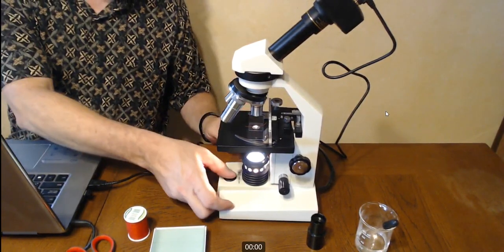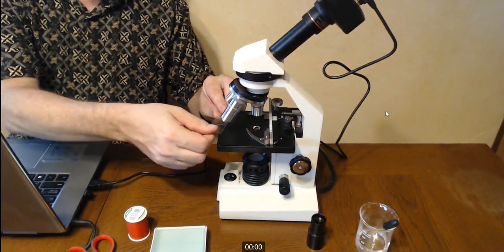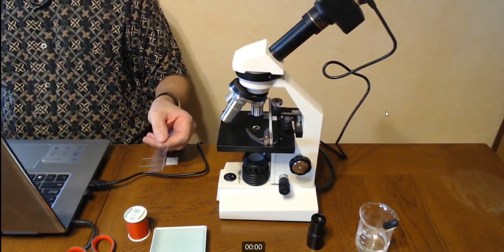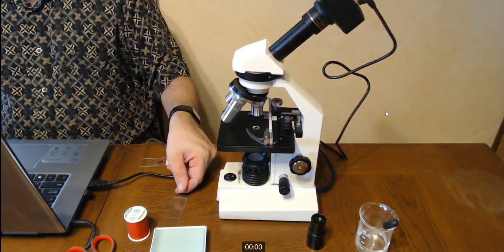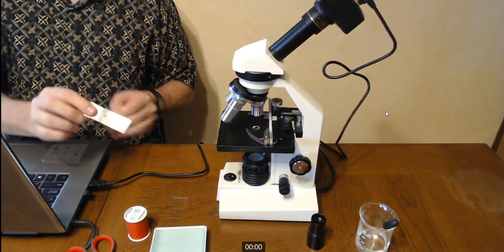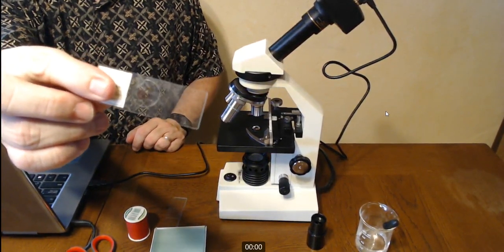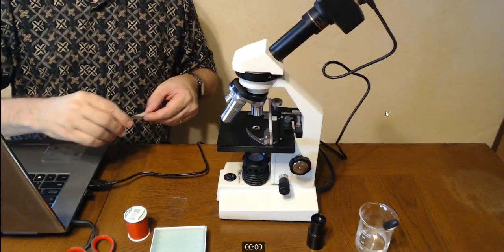Then you can go ahead and turn off our light, although we'll be putting another slide right on, and remove the cover slip, or remove the slide. This will run to the bathroom quick, rinse, dry, bring back. Pretty simple. But let's take a look. I've got a Pine Life History here. If you look close, let's see how well we can see it. You got just some different cross sections of small cones and things like that.